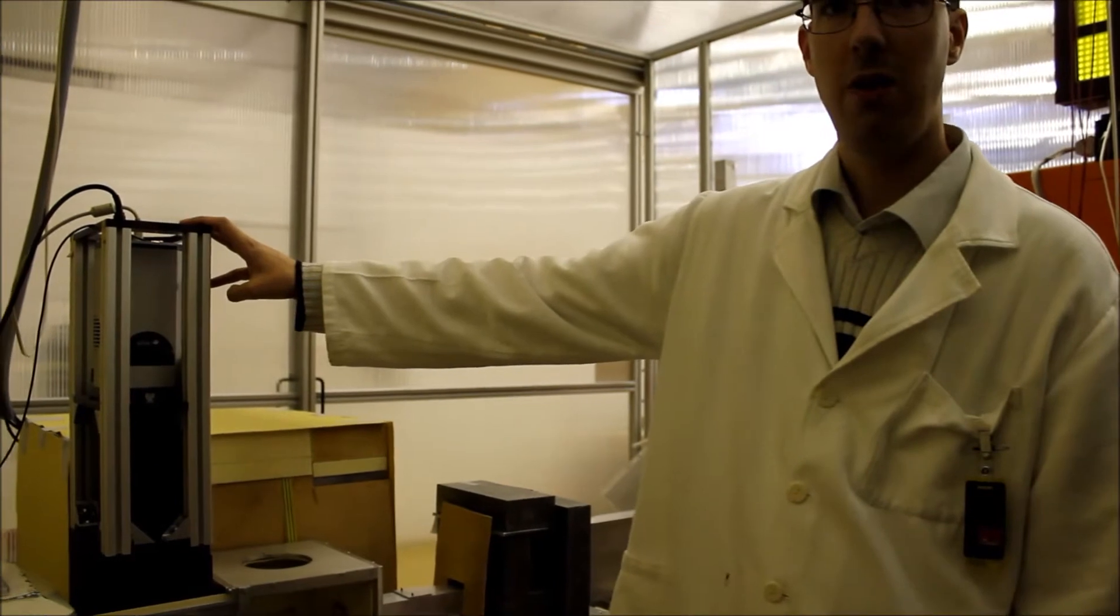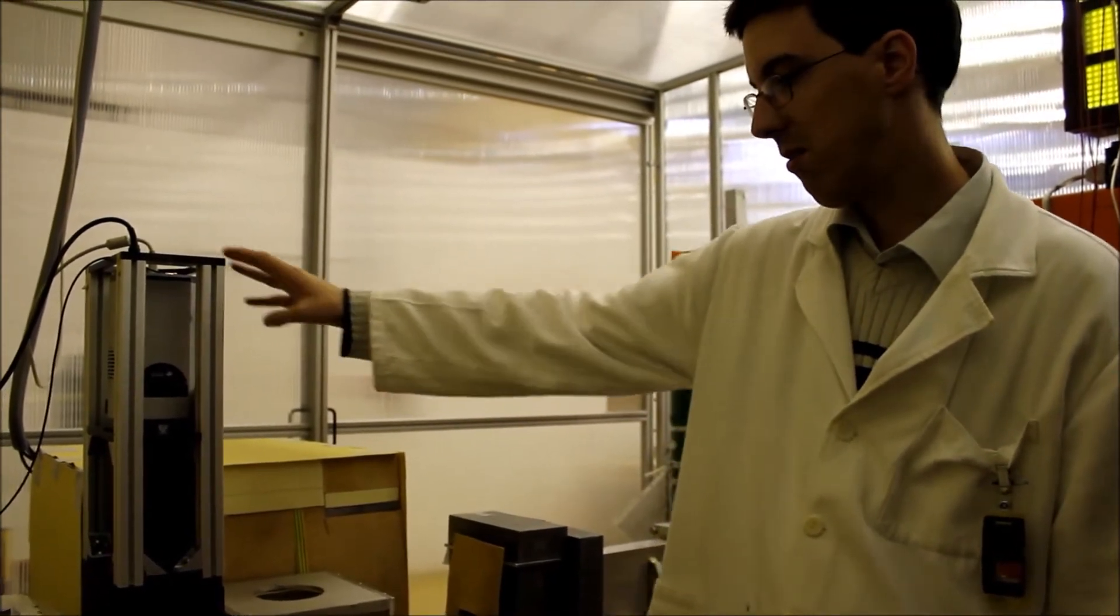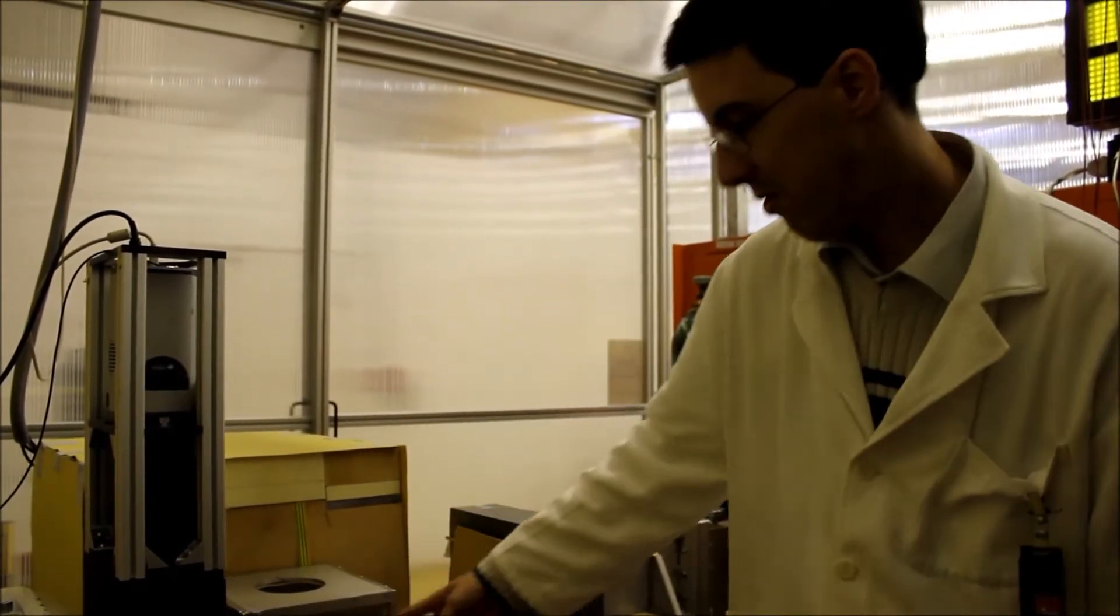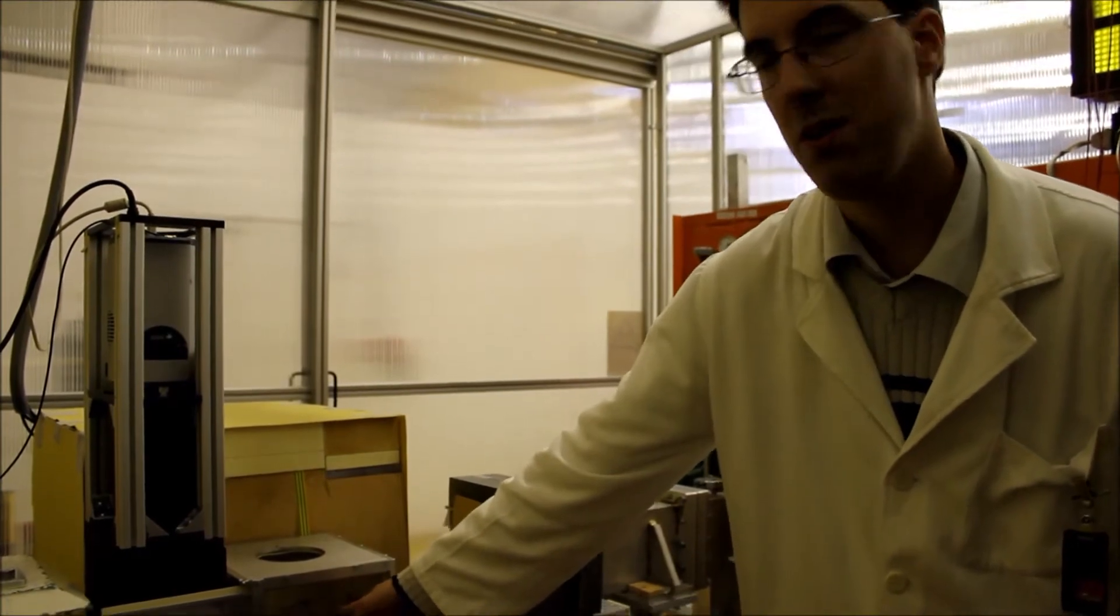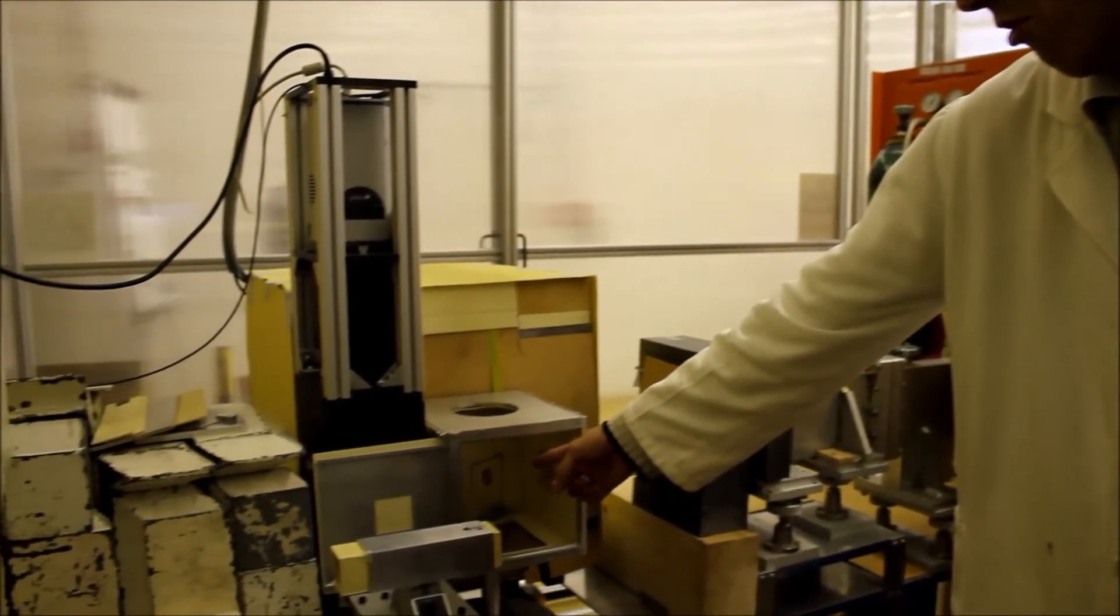This is a neutron tomography camera that detects the transmitted beam through the sample, which is placed inside the 20 by 20 centimeter sample chamber.